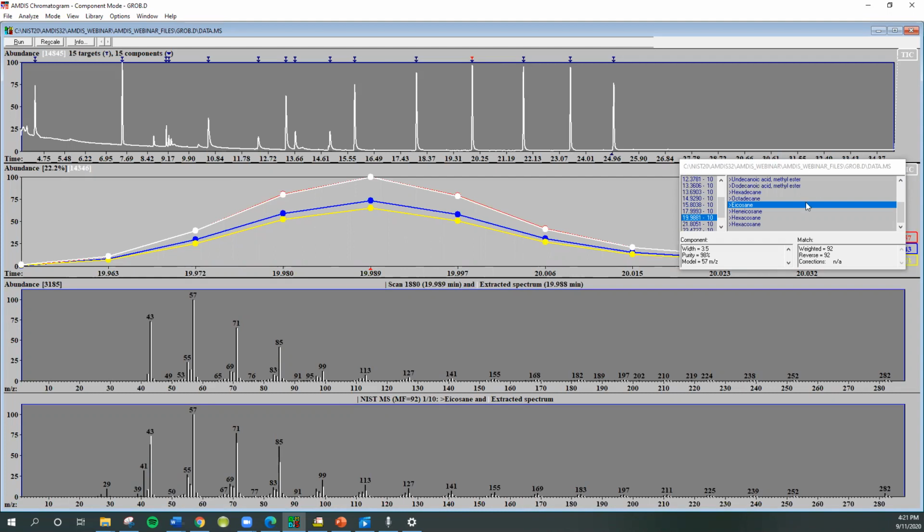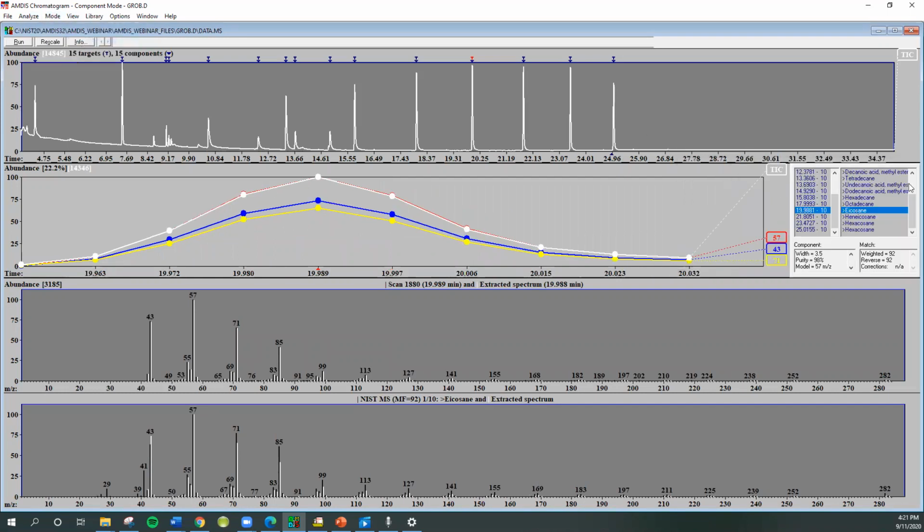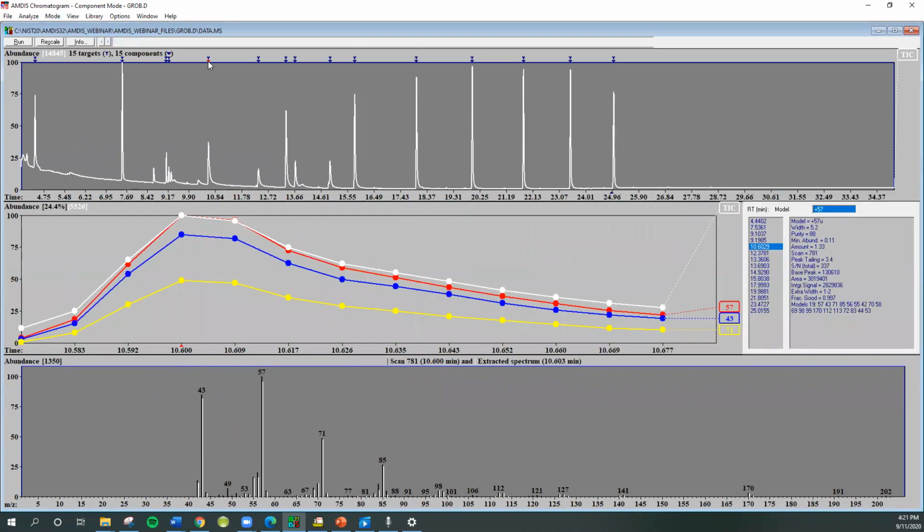But the other thing is I find it really handy. Let's redock our friend here to get him out of the way. So view, undock, and it just makes him jump over where he should be. Made him small again. So what I want to do here is I want to see where things come. So you have to trust me here. I'm going to go to the components. Instead of being on the T, I'm going to click on the little triangle. So I just go to the deconvoluted spectra.